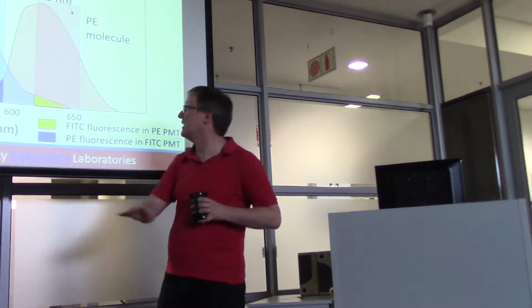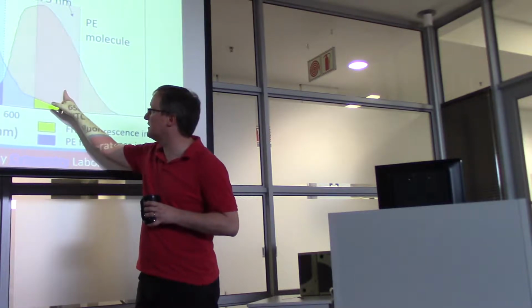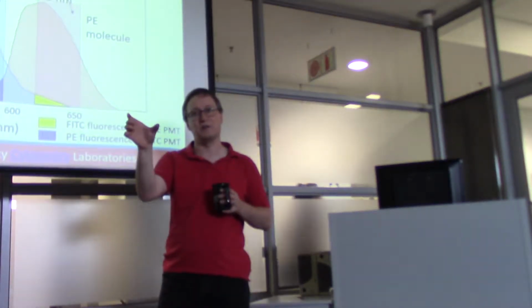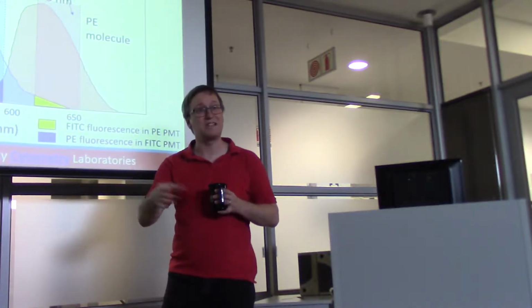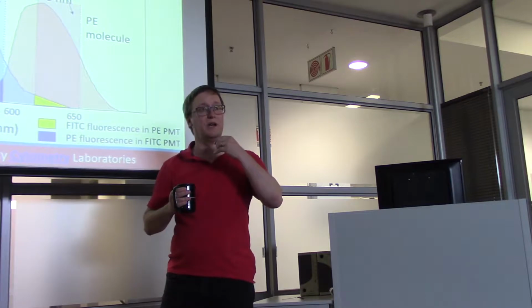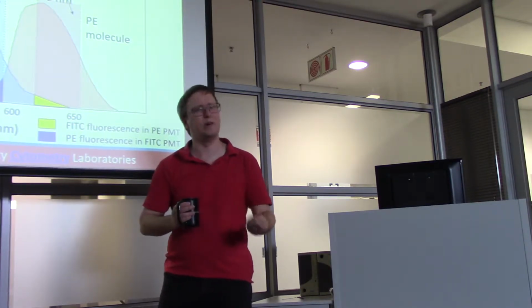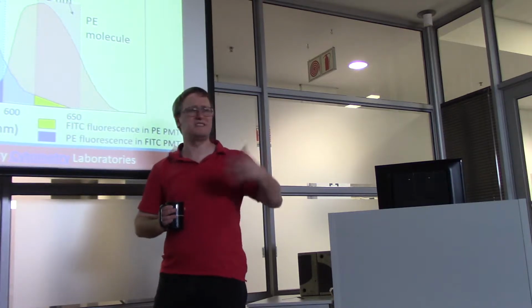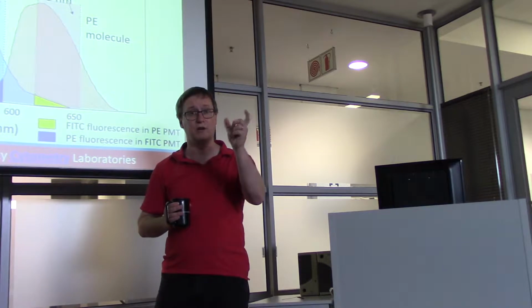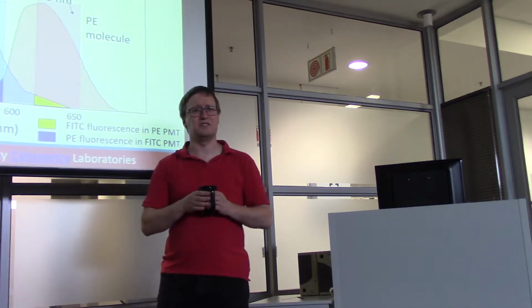That's a little messy, because now you could be receiving only this red signal and think that you're seeing a bit of the blue signal just because their spectra overlap. So that's problematic for us. We want to be able to translate the amount of light we receive into a quantity, or to say there are some number of fluorescent bodies in the sample and it's this. But if you have crosstalk going on, it can be a problematic situation.